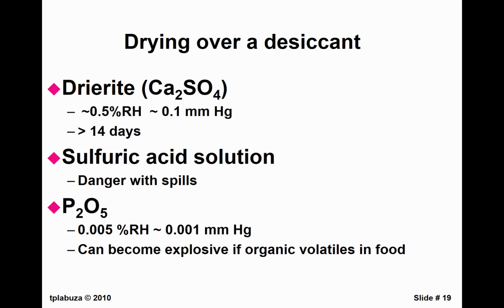That wasn't my idea, but one of my graduate students decided they were really going to get it dry. And it was labeled, so that was good. The label on the desiccator said phosphorus pentoxide. And they quickly looked that up, and it's supposed to be white, and it was sort of black, and it was sort of bubbling. Right?